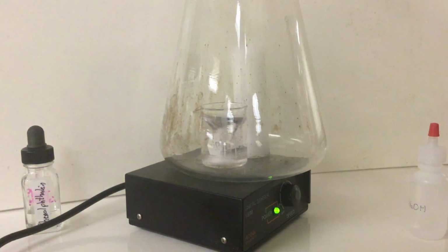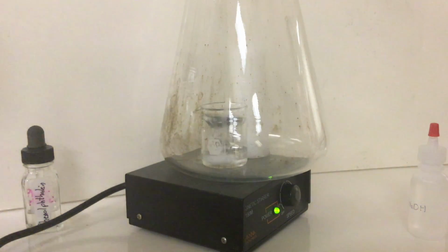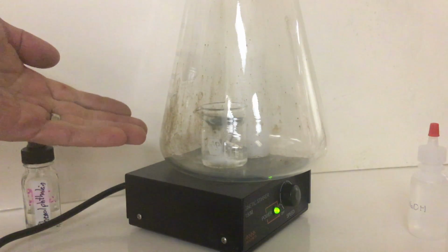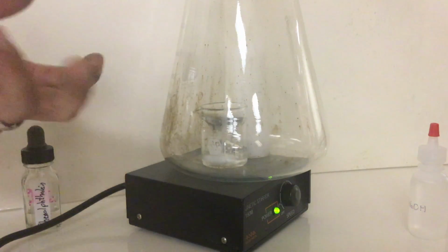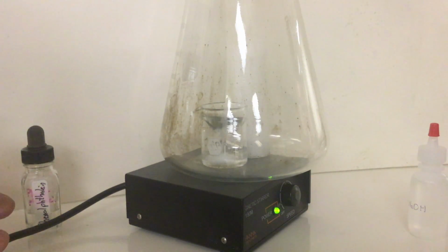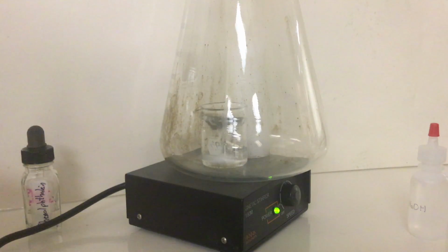Okay, it might seem like magic. That's why we call it the magic candle, but I tell you it's not magic, it is science. What happened? So I want you to tell me in your Flipgrid response, one, what is the analogy? What are the items in this representing? What does the candle represent? What do you think the beaker represents? What do you think happened? Make an inference. Tell me a little bit about the chemistry that you think occurred. And how does that represent this analogy? What do you think the big analogy is that we're talking about here? That's the main thing I want you to tell me about in your response.